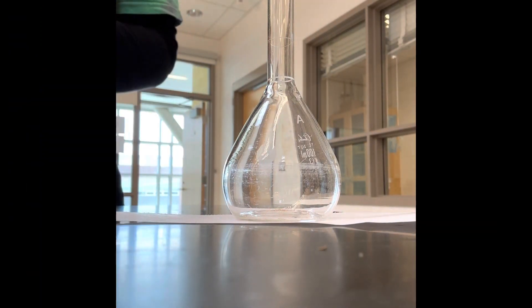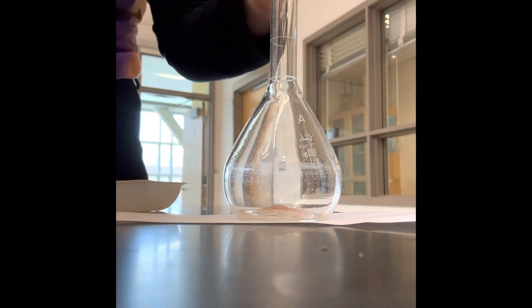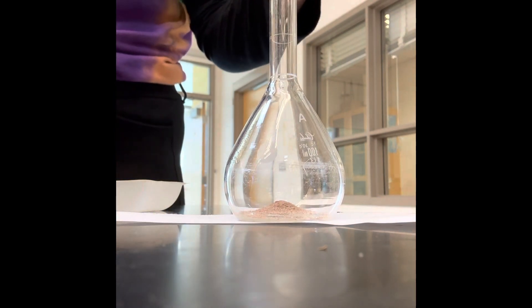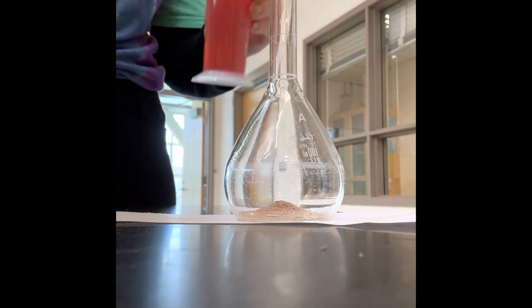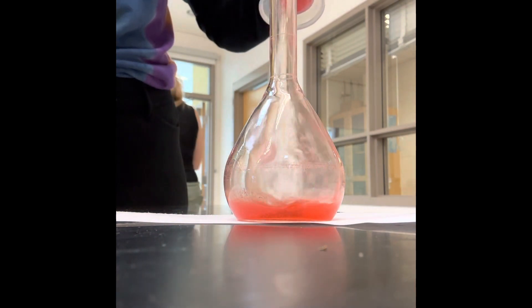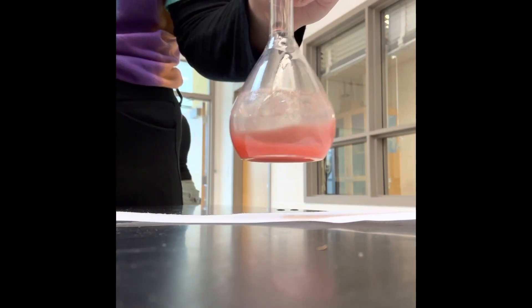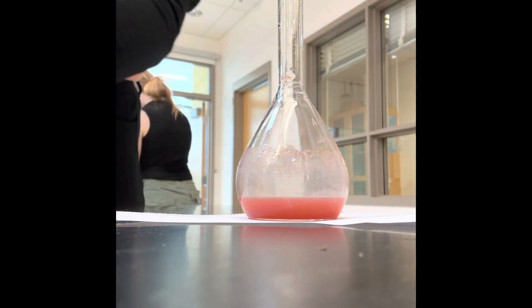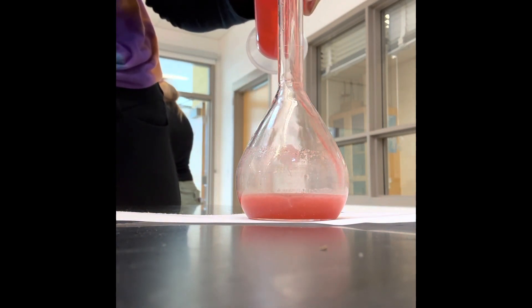Then use a funnel to add the solid to the volumetric flask. Then add a little bit of your solvent. Then swirl until the solute is dissolved. Then continue adding solvent until you reach the desired volume.